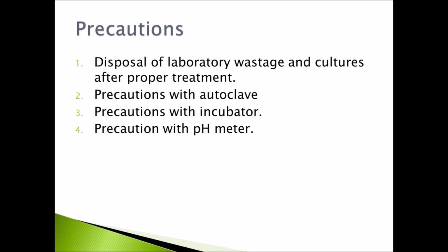While performing experiment in relation to isolation of genomic DNA, EDTA, NaCl, CTAB, Tris-HCl and ammonium acetate should be autoclaved. All glassware should also be autoclaved. Chloroform isoamyl alcohol 24 is to 1 should be freshly prepared and stored in a dark bottle.